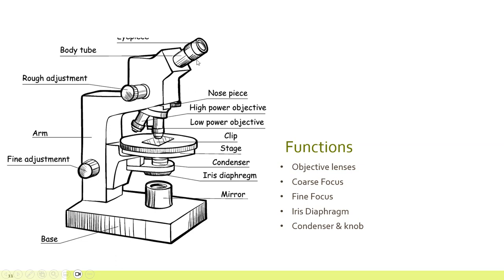So you stack those, which is why it's a compound microscope. You have your compounding objective or magnifications, right? So you're compounding your eyepiece, you're compounding your objectives. And we're usually working around that 40x magnification is where we actually can see these things. And I'll show you some pictures of what that looks like ahead.